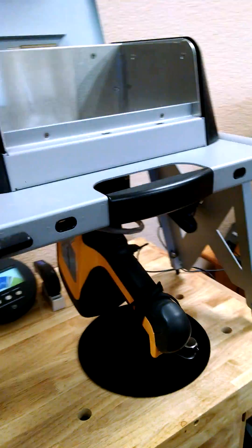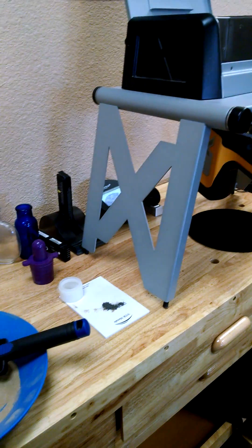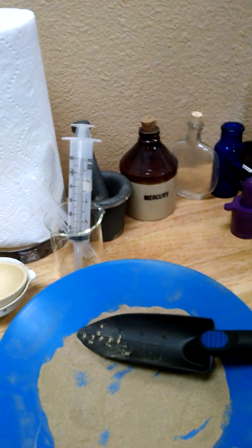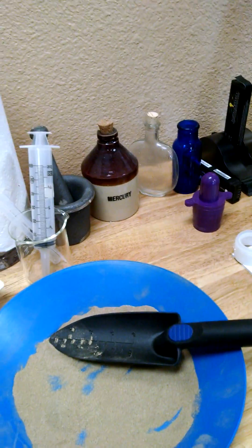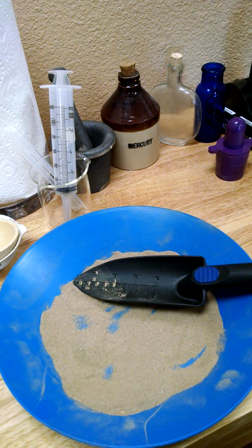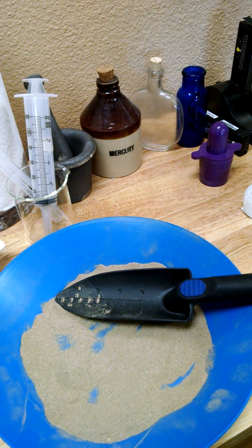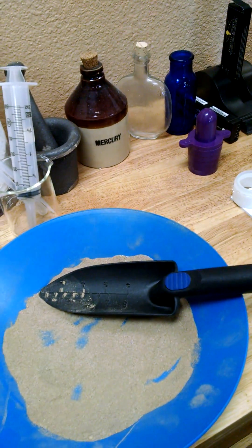This machine is portable — we could take it down to the desert with us — but it's much easier to bring the material back. It's a lot more accurate if we grind it up and homogenize it. What we did: we ground this up and meshed it down to a minus 50. I wanted to make sure there weren't any nuggets in there, because a little piece of gold would really skew the results and show some fantastic amount. We just wanted to see the really fine stuff, the type we get while dry washing.